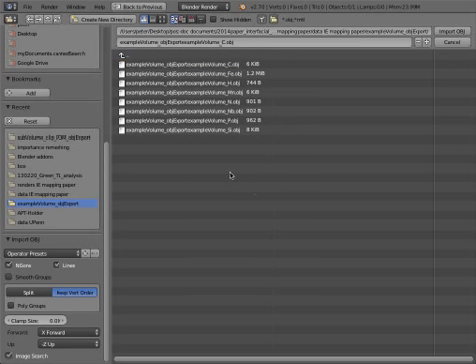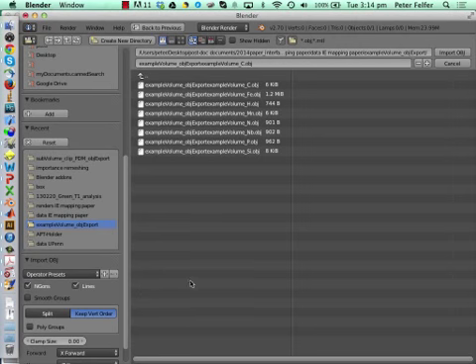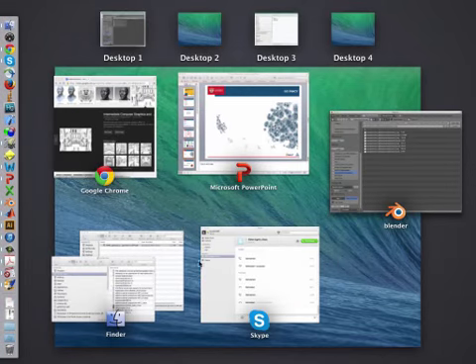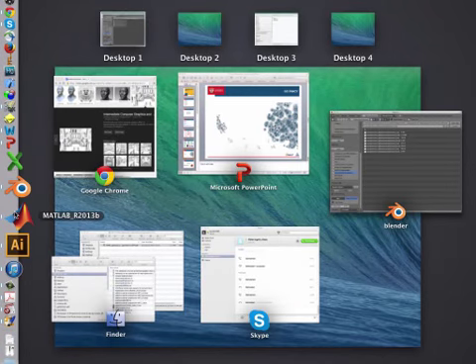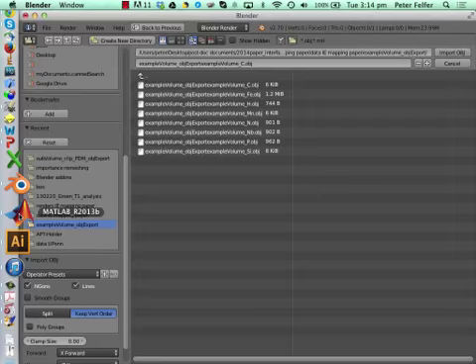Yeah, your data is not split up. Okay, let's go into Matlab and actually create the OBJs. No, you're supposed to create the OBJ files now. That's part of the exercise.